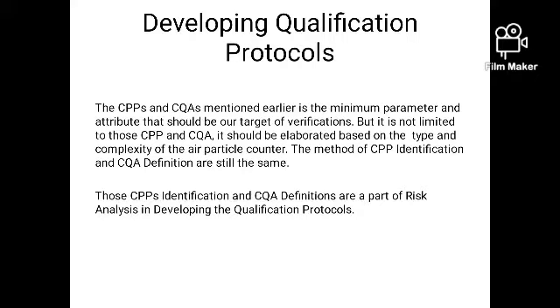Most people have difficulties in developing the protocols. They will just take the manuals and face the PC or laptop while expecting their hands to start typing the protocols or procedures, but in time, their hands do not even start to type. So, knowing the CPP and CQA will be very helpful to start developing the protocols. You will understand the 5 Ws and 1 H in the air particle counter qualification process.